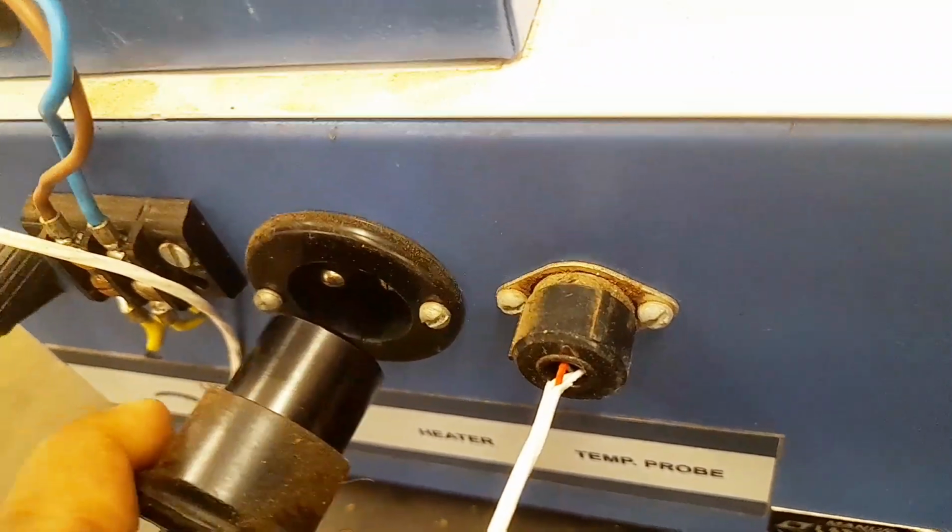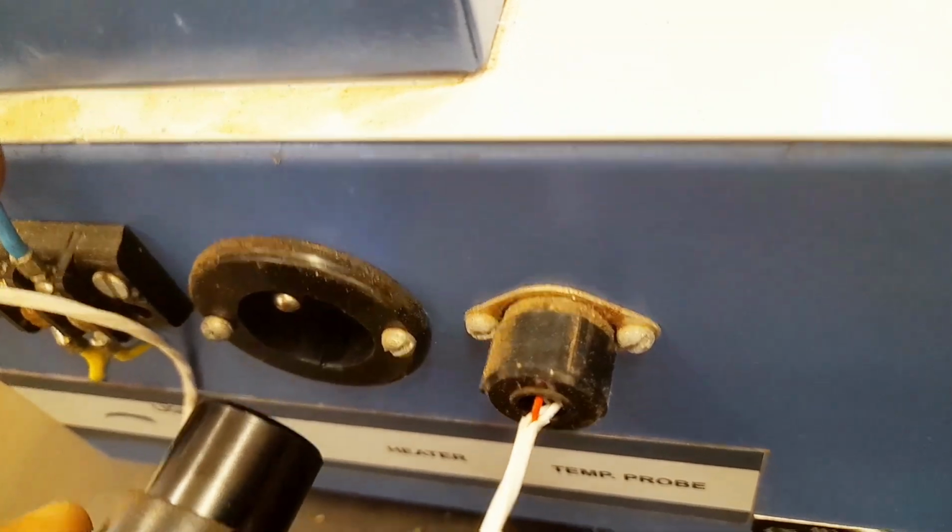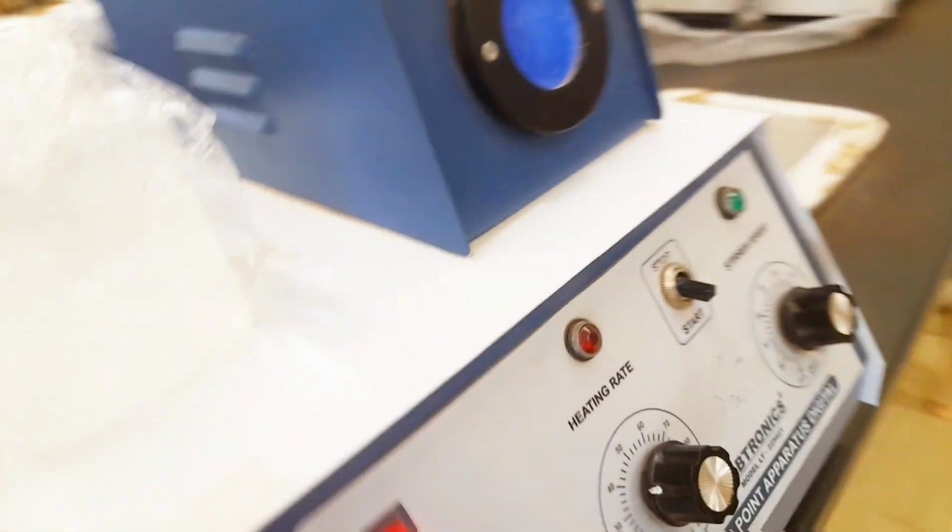When the sampling process starts, we have to keep this so that the temperature increases. Until then the temperature does not work. This is the temperature knob, we can say. So this is the setup of the melting point apparatus.